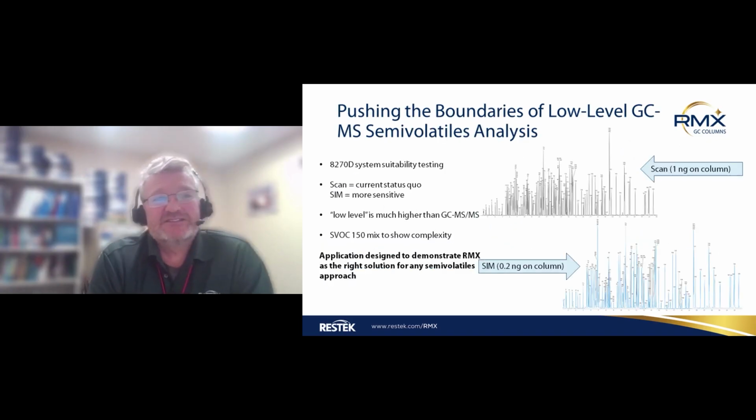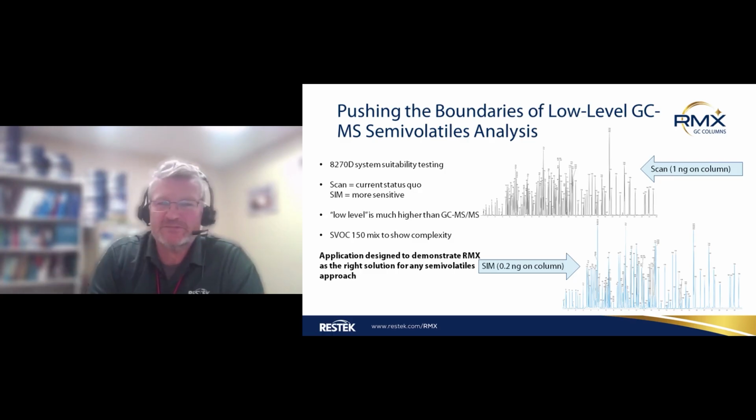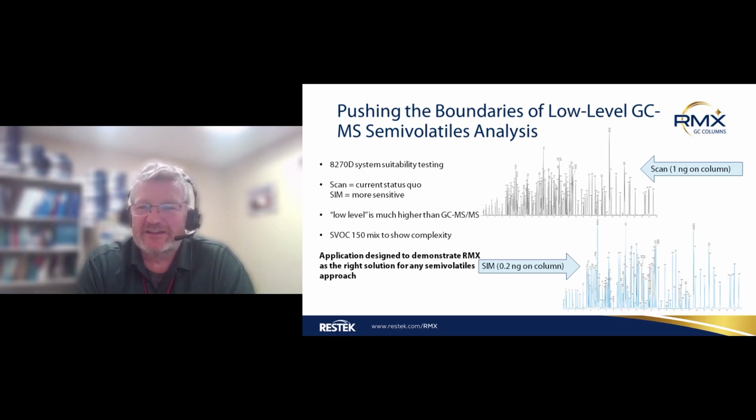In this case, this is the GCMS at 1 nanogram on column, which we easily have the sensitivity necessary for. That's certainly not a problem, especially on a standard, newer GCMS system. With single-ion monitoring, again, we have plenty of signal down at 200 picograms on column, or 0.2 nanograms on column, in this chromatogram.